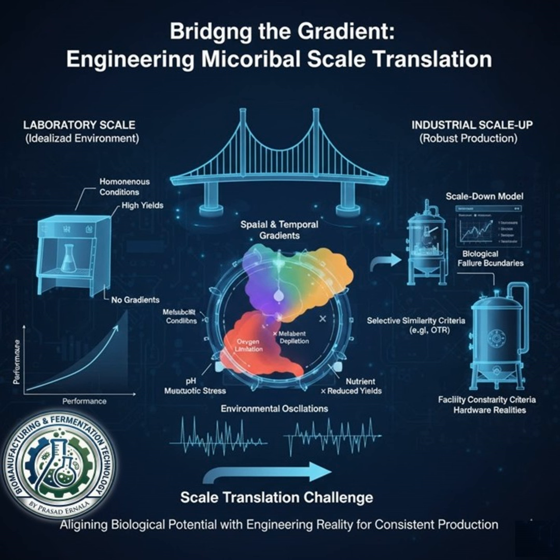Yeah. Because this is really where the money gets lost. As vessels get bigger, the flow just isn't uniform, and the mixing time skyrockets. Yes, and that creates these sustained invisible gradients in everything the cell needs to survive. Which brings us directly to a really key concept, the bulk DO fallacy. Yes, the big one. So tell me about that. Why is that bulk reading on the screen lying to the operator?